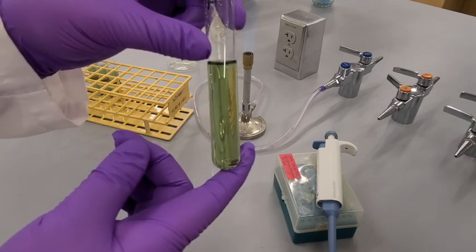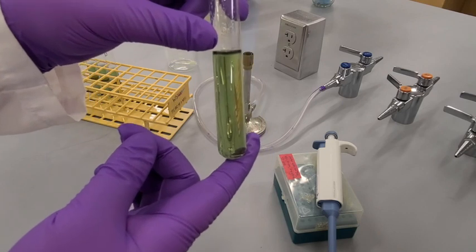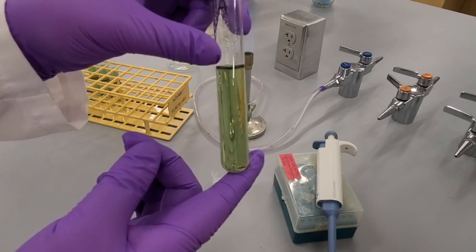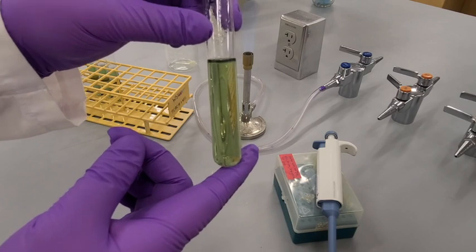It contains a pH indicator called bromocresol green that when the pH is lowered will turn yellow and when it's increased it will turn blue.